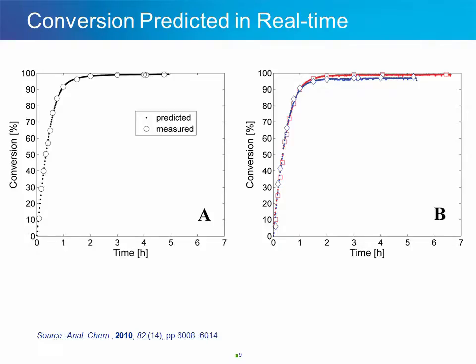The second thing to point out is how much information there is in the infrared that can be missed by offline analysis. Due to the constraints of analysis by offline methods, which are mainly the time and labor involved, you have to take a limited number of samples and live with the gaps in between the samples. Real-time FTIR provides a continuous stream of information with a new set of quantitative values refreshing every minute or so.